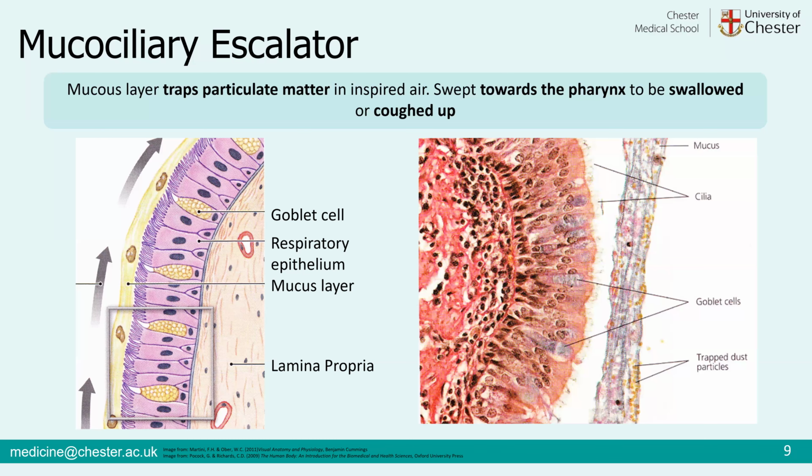And we can see here on an actual histology image. So there's our respiratory type epithelium. That's that mucus, and all these little dots are different trapped dust particles and particulate matter doing its job, capturing all that, preventing it from getting down into lower airways.